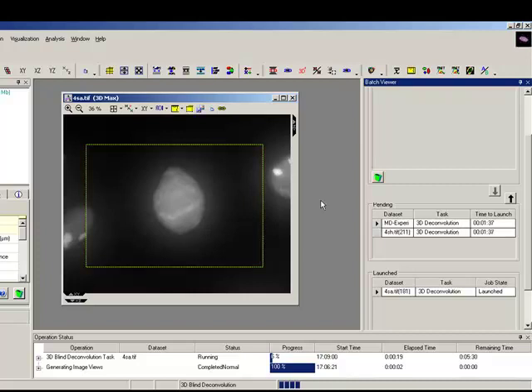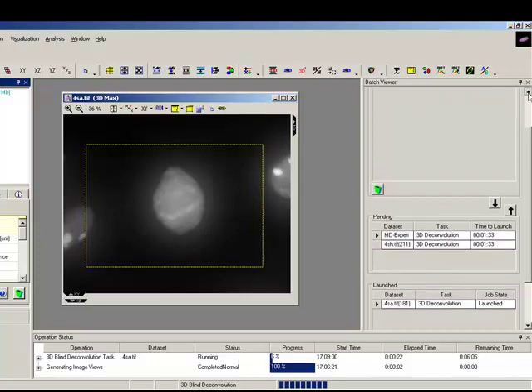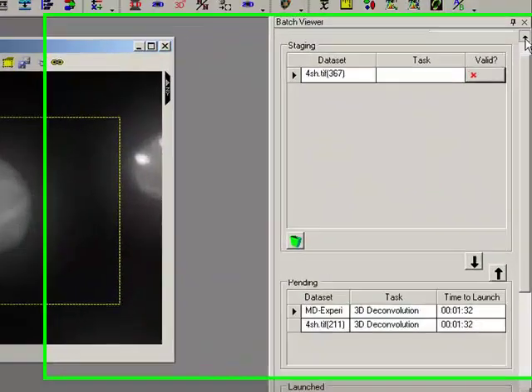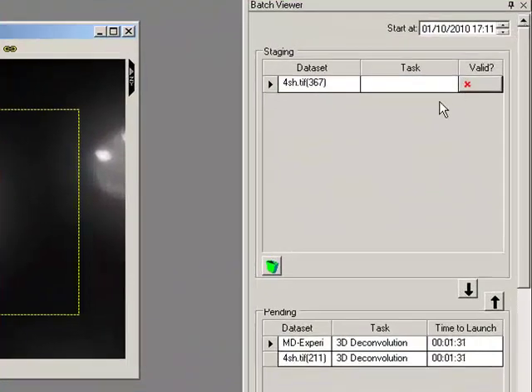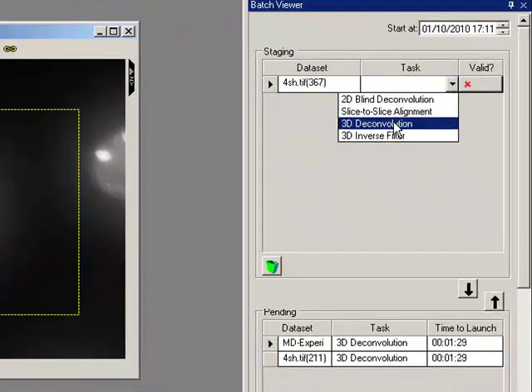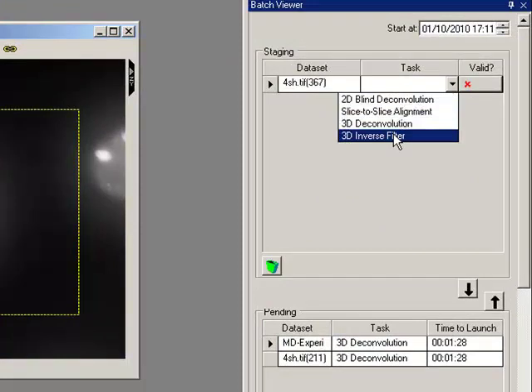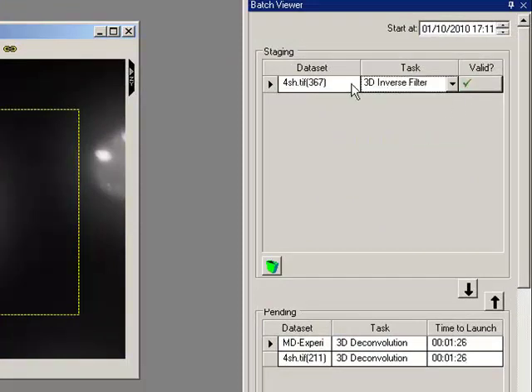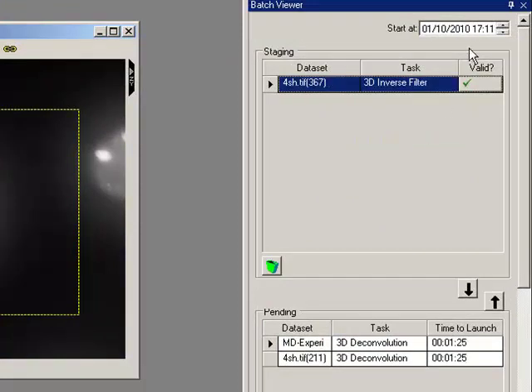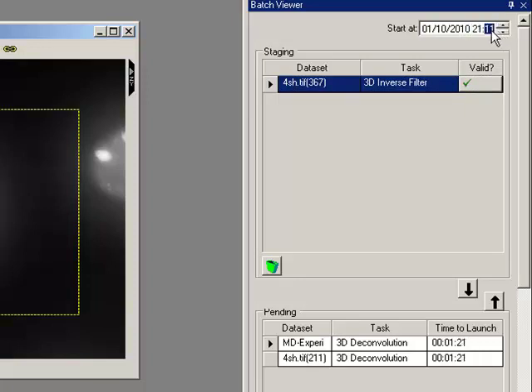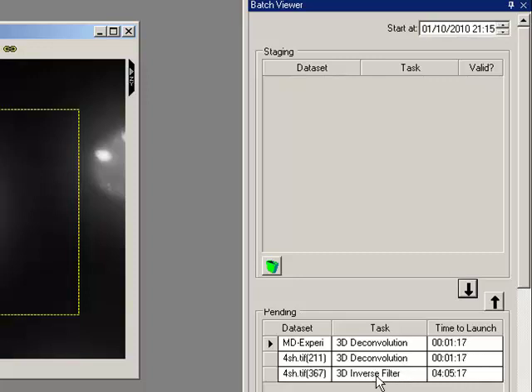I can also add these datasets and deconvolve them at a much later time, so maybe I want to deconvolve this one overnight while I've gone home. Maybe I'm going to set it to a 3D inverse filter this time and I'm going to say I want you to do this at 1:25 tonight. Pending, and there we go, it's going to launch in 4 hours, 5 minutes and 14 seconds.